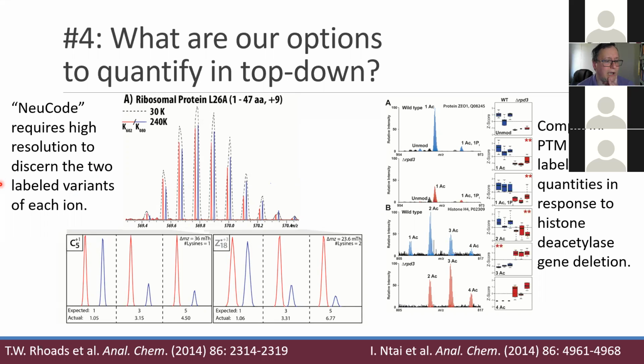Okay. So I think that ionization efficiency is less a problem when you have a larger molecule like this, because there are more ionizable sites on it. It's also the case that even though I've highlighted Electrospray as a front end to mass spectrometry, a lot of people trying to do top-down are doing it with time-of-flight instruments, and for them, a MALDI ionization source would be preferable.